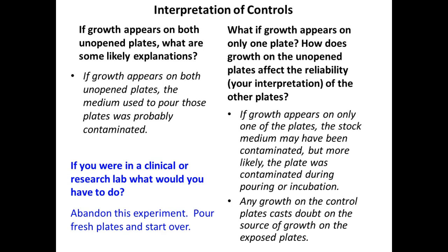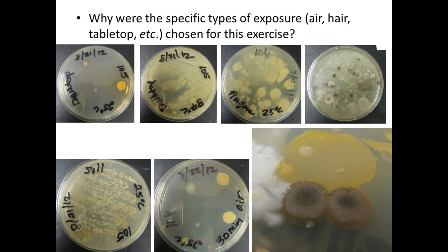The good news is this is a teaching lab, so if we get growth on our control plates, we're not repeating this experiment. This experiment is designed to, and as you guys saw, some of the growth that we saw on yesterday's plates, and these are some pictures from past semesters. And this was a growth that I was hoping to find, but didn't have any.